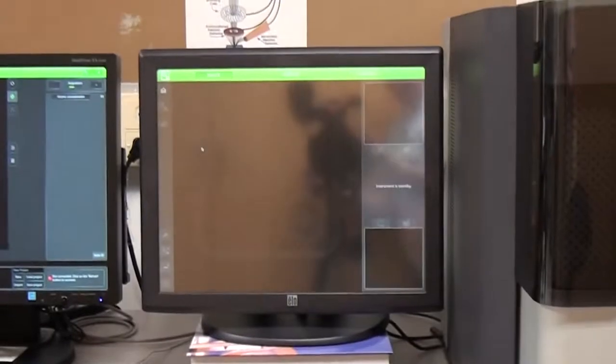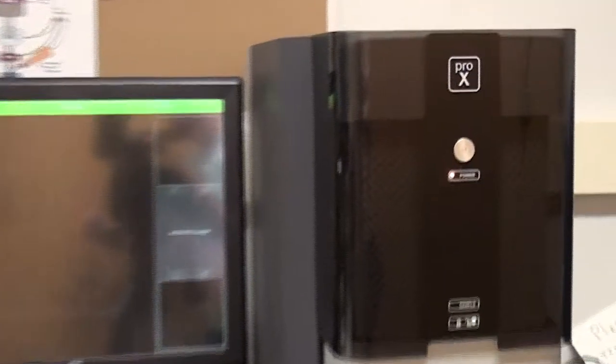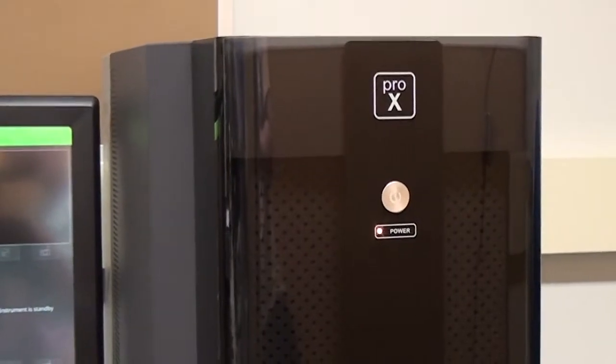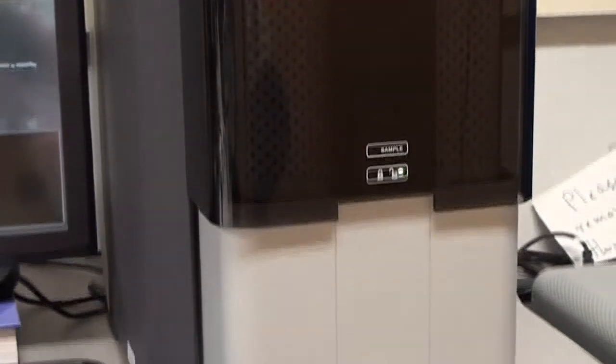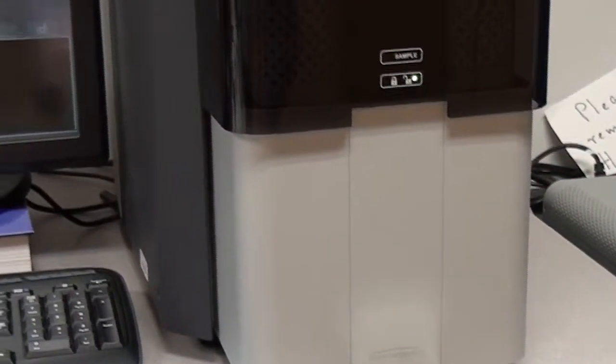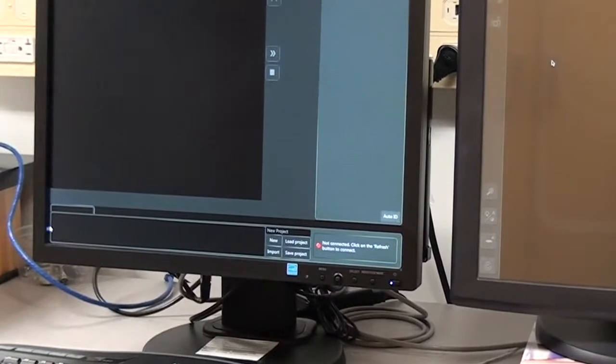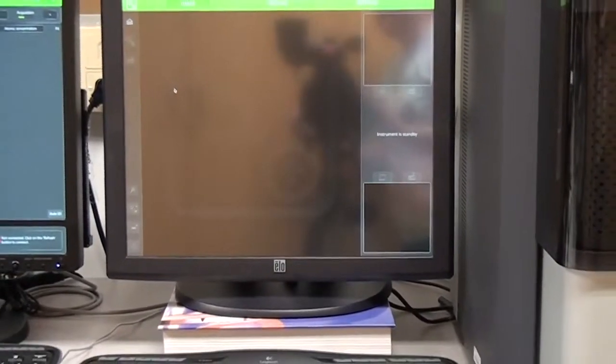At NOVA, we use the Phenom Pro X scanning electron microscope. It is a high performance electron microscope with integrated energy dispersive spectroscopy, or EDS, capabilities. The Phenom SEM has a maximum magnification of 150,000 times, a maximum digital zoom of 12 times, and a resolution of less than 8 nm.